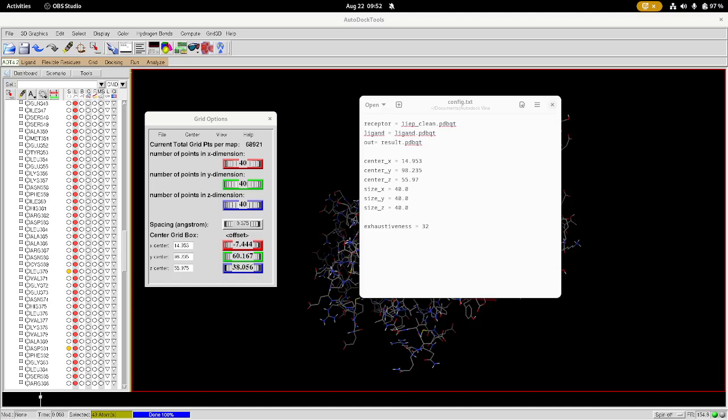Okay, so now you're going to create a config file like how I've done right here. This contains all of the settings for our docking run. This is much easier than typing all this out in the command line every time you want to run it or change something.